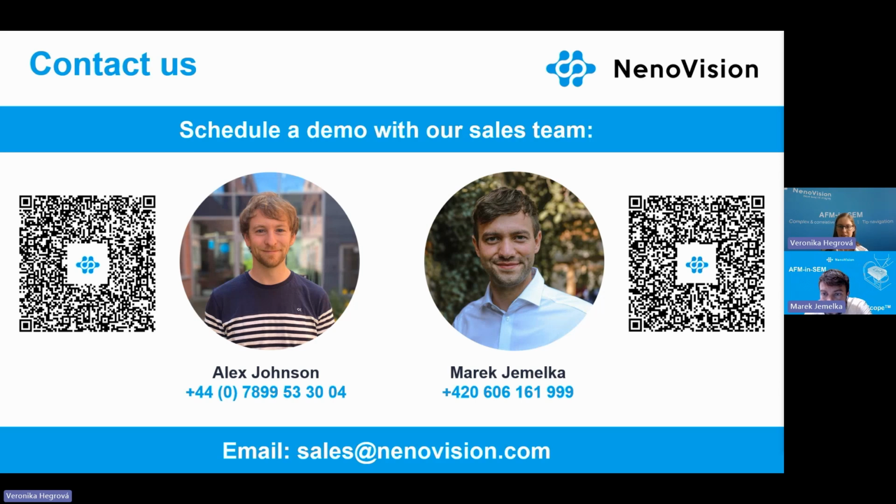I have here a question from Wojciech. Hello all. What is the current lifespan of your probe for conductive AFM and SSRM in terms of area and number of scan cycles, ideally?